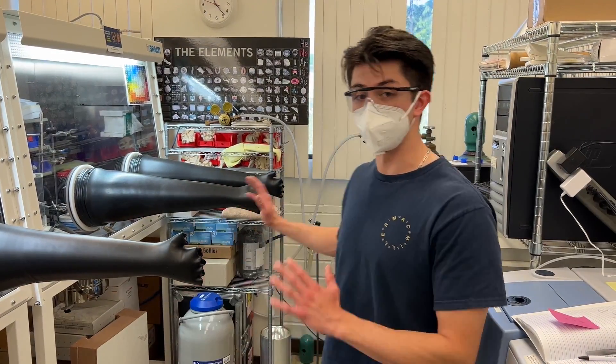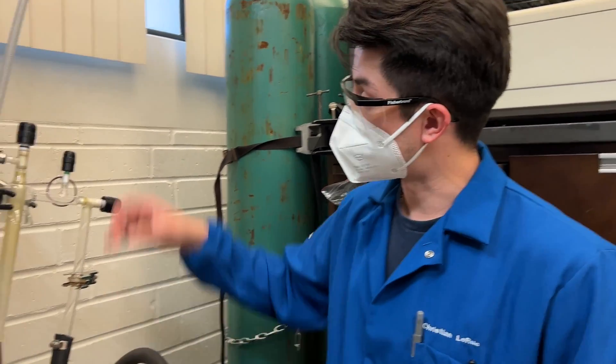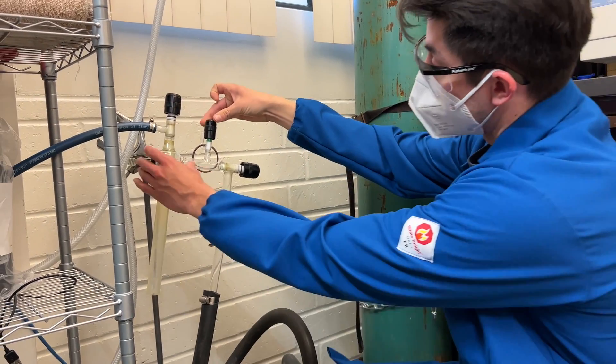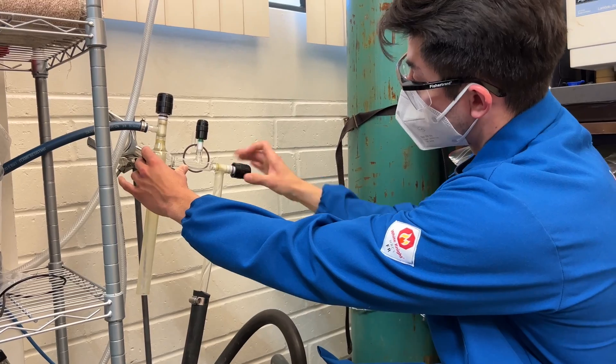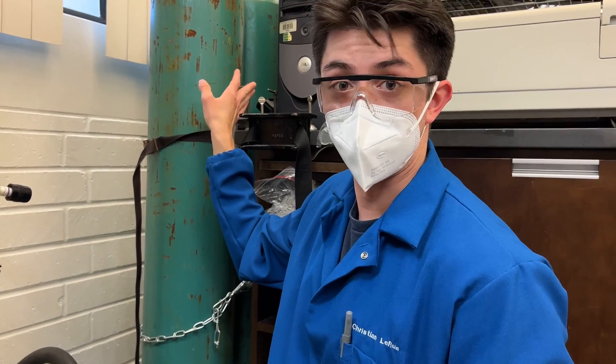Now that we're familiar with all the pieces to our cold trap setup, let's go ahead and put on our lab coats. Before we turn on our trap, we're going to make sure that all our valves are closed — righty-tighty, we're going to make sure they're all tight. From that point, we're going to go ahead to our surge protector and turn on the power.